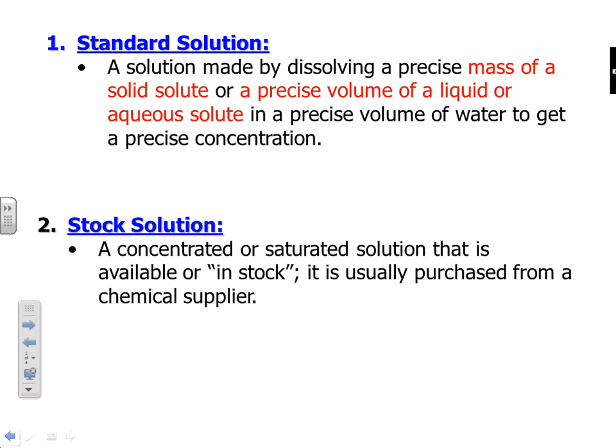We could use a graduated cylinder. We've seen those. They're skinnier and they've got more markings. They're a little more precise. But these devices that I have on the bench here, the lab bench, are the most precise instrument that we use for measuring volumes. They're called volumetric flasks, and they're designed to measure one volume. You'll notice there's not a whole bunch of lines on them. There's actually just one line right there on the neck of this particular device.